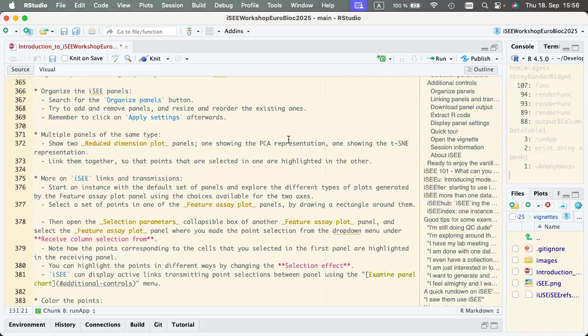But if it's just about starting your app with a couple of genes, then that should work. So you can actually recycle some things. And I think the best part is that if something is not going to work, because some cells are just not in there, I don't think the app will crash. It's more like it might fail gently. I cannot promise that. Or fail silently, which actually might be nastier.